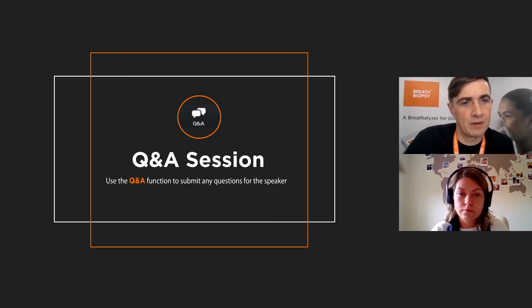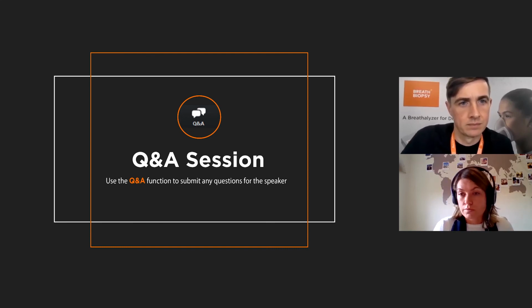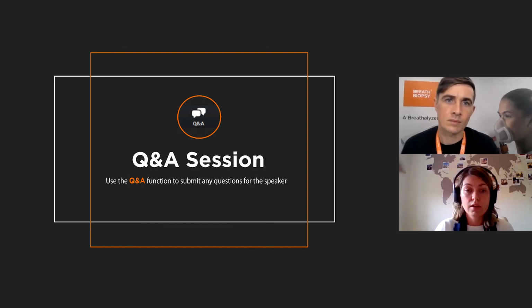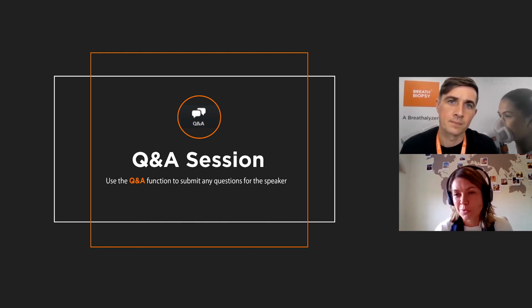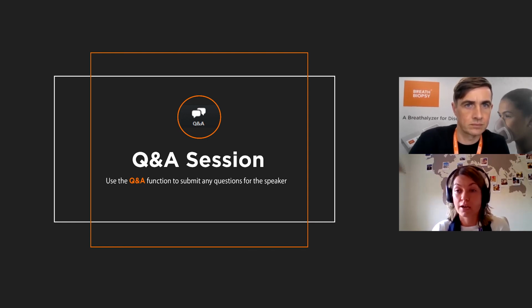Question from Kaylee. Which file formats can ChromCompare+ be used with? It works with a range of different files for both 1D and 2D data, like you saw in the presentation, and it can be used for a range of different GCMS vendors, from .d Agilent files, .raw Thermo, to LECO or CDF files that then work with quite a range of other GCMS systems. So it is able to cope with quite a wide variety there. And even though the alignment won't work for the single channel data, currently it's for the GCMS only, like I said, you can still use the chemometrics part for single channel data like FID, for example.